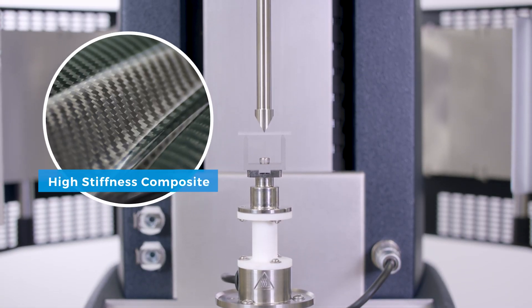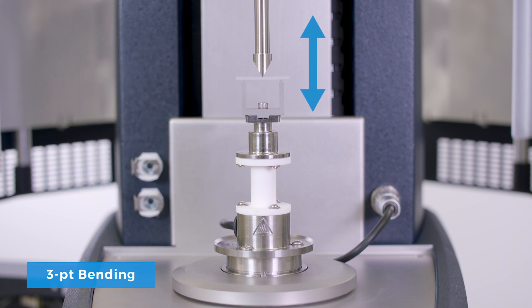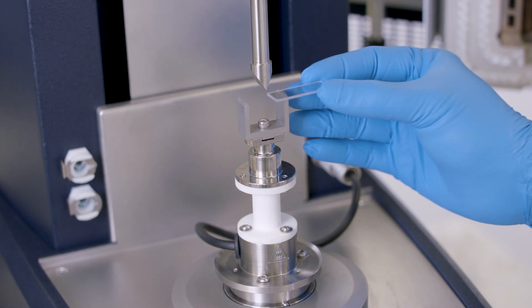For testing high stiffness composite bar samples, the three-point bending geometry is the best option. Since this type of materials maintain their structural rigidity, even at temperatures above the glass transition point.